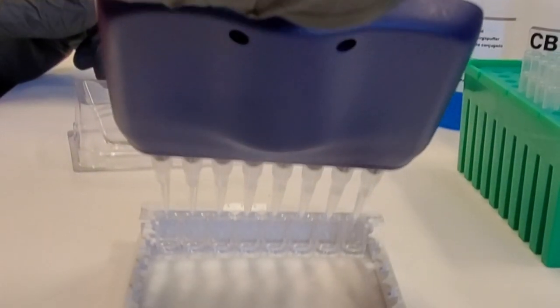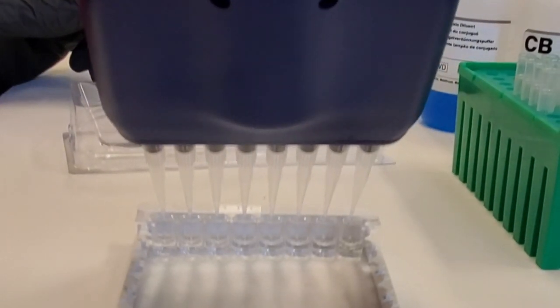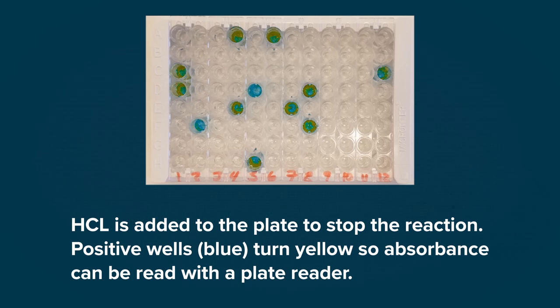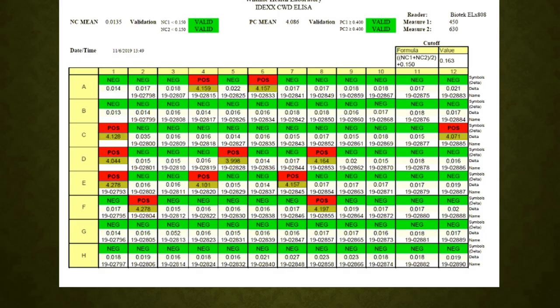Next, we add a color-changing substrate to the plate. In 15 minutes, the substrate reacts with the attached enzyme to produce a color change. Hydrochloric acid is added to the plate to stop the reaction. Positive wells, in blue, turn yellow so absorbance can be read with a plate reader. The absorbance is read, and we perform calculations to determine negative and positive status.